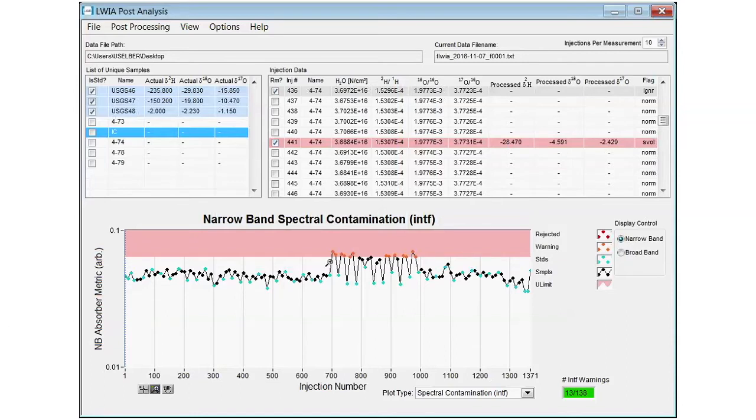That indicates that you're very likely to have some methanol contamination in this water sample. There are a couple of things to do about this. One thing is to measure it on a different type of instrument, such as an IRMS, and the other way to handle this problem is to use a correction such as that done in the Schultz paper, and the reference for that paper can be found in the manual if you want to take a look at it.